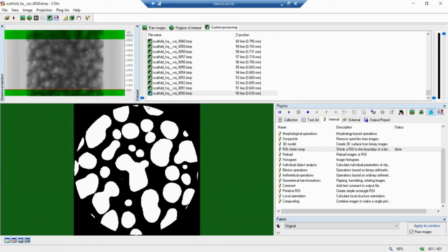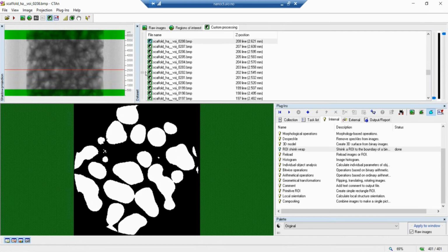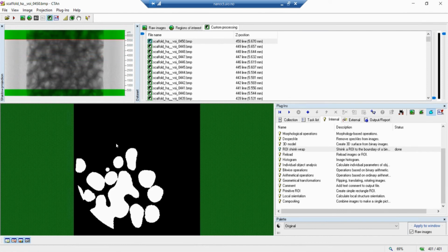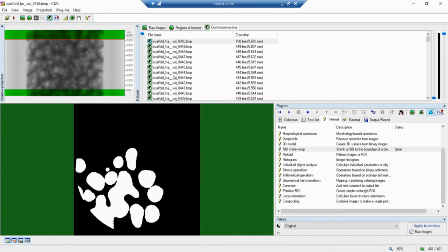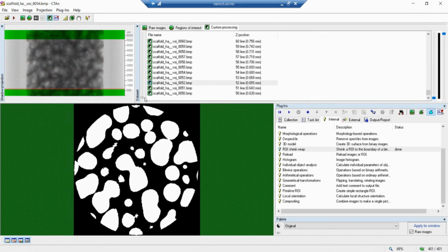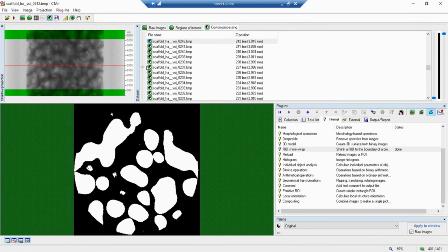We are looking at the region of interest, and it just kept the pores that are connected throughout my image. So if you go all the way up here, you see that only this amount of pore is still remaining, and the original one was this one. It means that only the connected ones are kept all the way. You see that on the bottom here, all of them are still here, and as we go up, the ones that are not connected are disappearing.